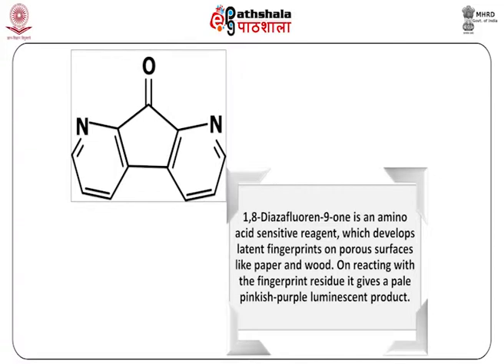1,8-diazafluorene-9-one (DFO) is an amino acid sensitive reagent which develops latent fingerprints on porous surfaces like paper and wood. On reacting with the fingerprint residue, it gives a pale pinkish purple luminescent product. The structure of 1,8-diazafluorene-9-one is depicted in the given figure.